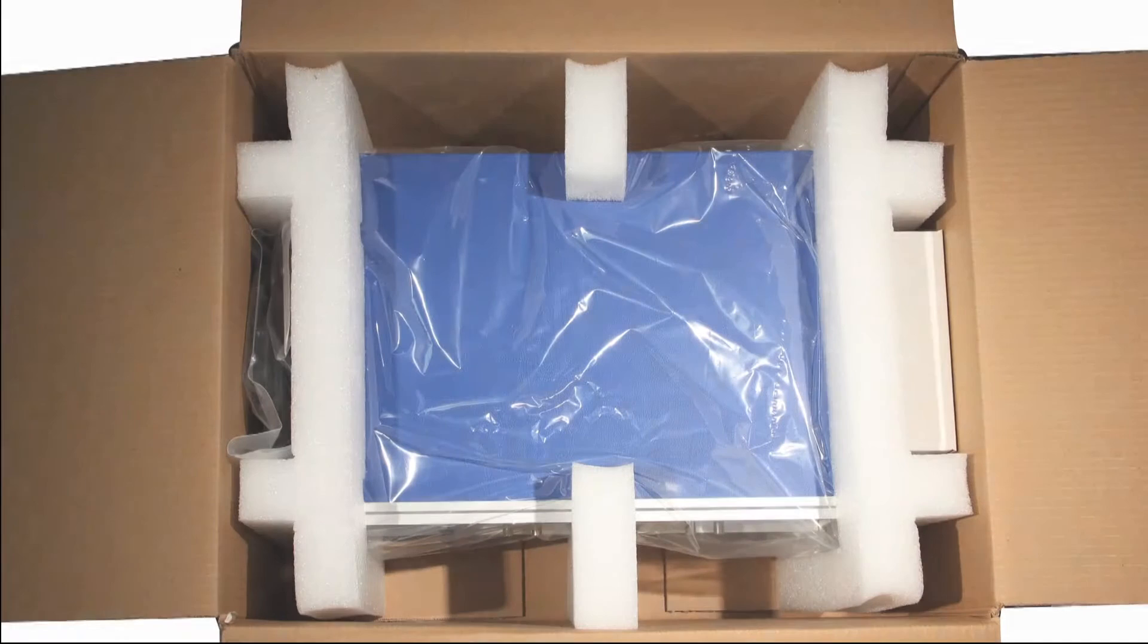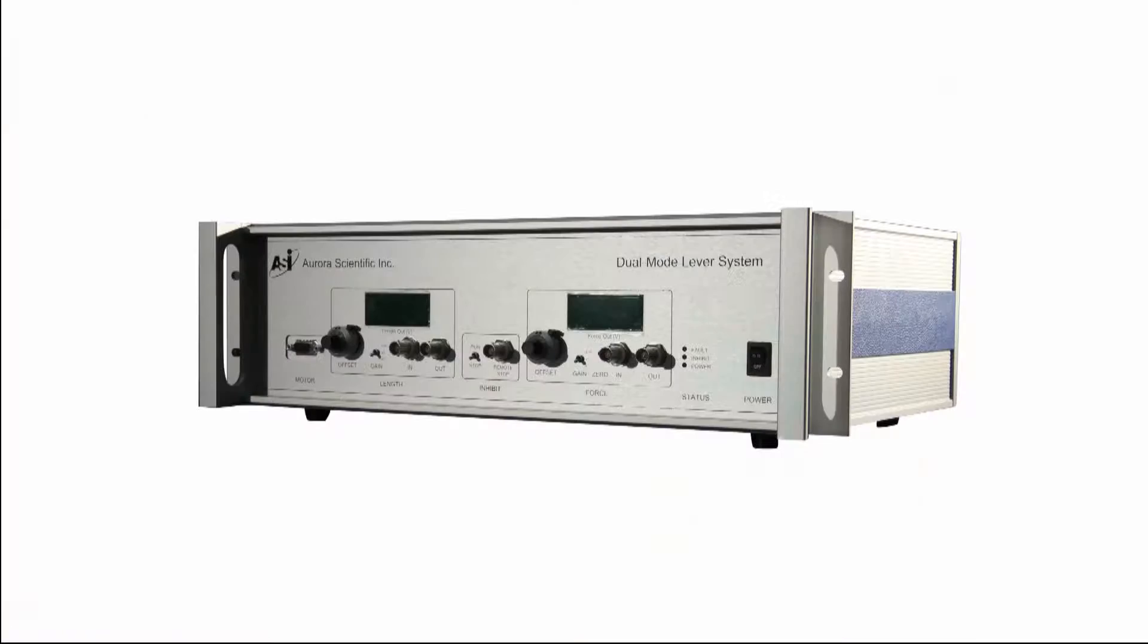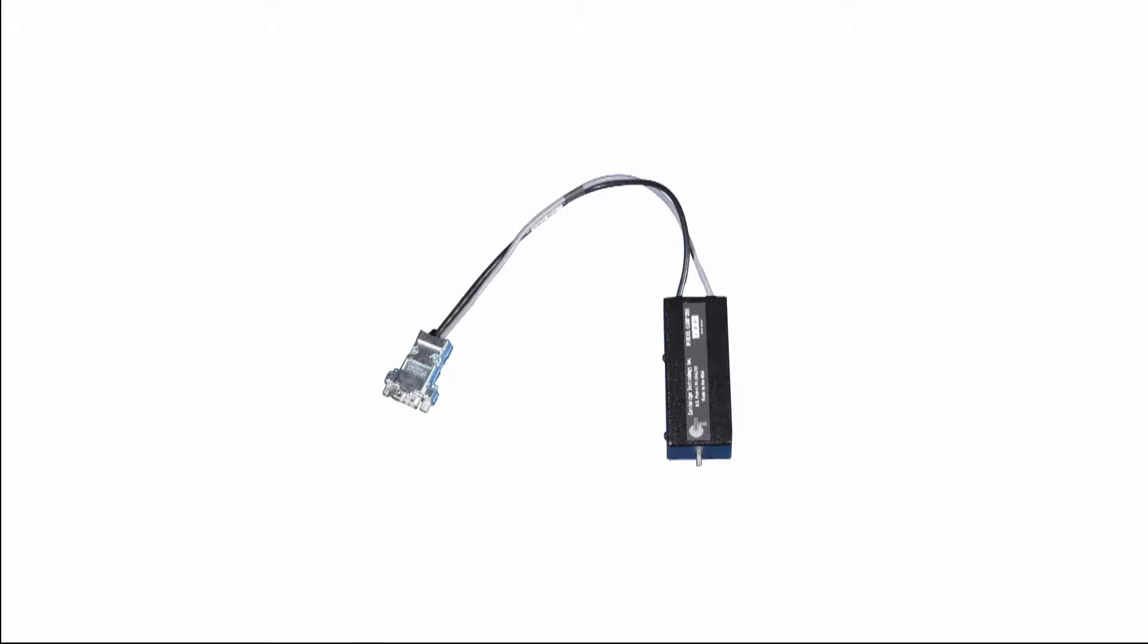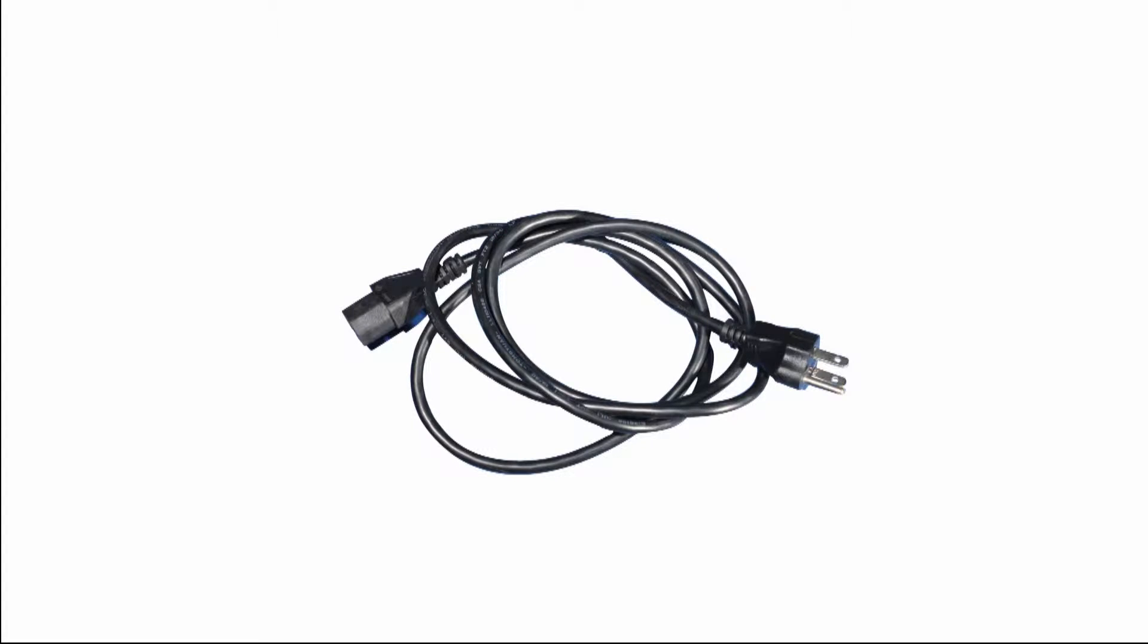Take care when opening the box and look for the following contents: the electronics box, the servo motor, the lever arm and allen key, the motor cable, and the power cable.